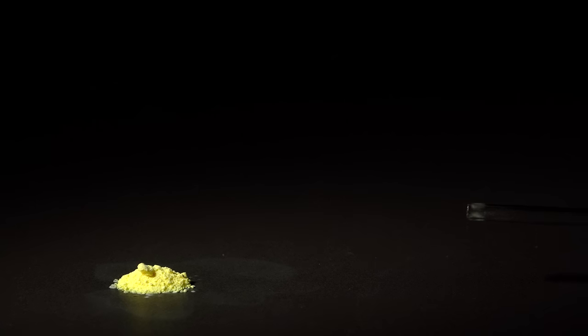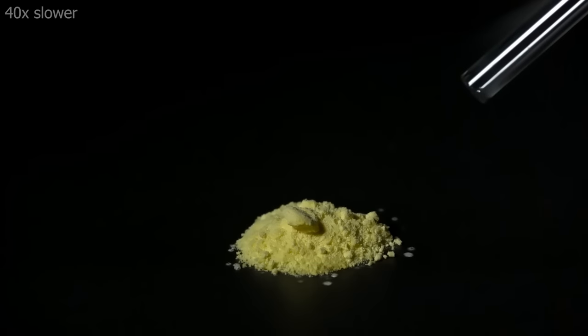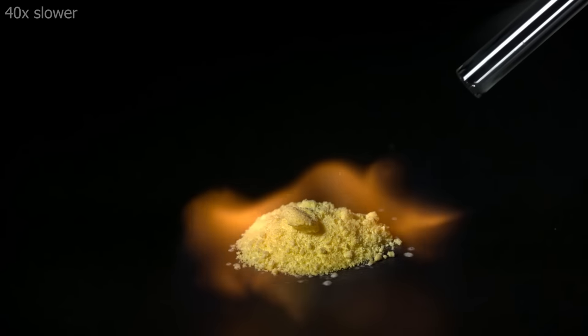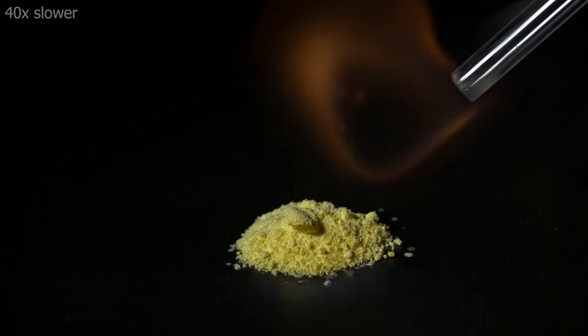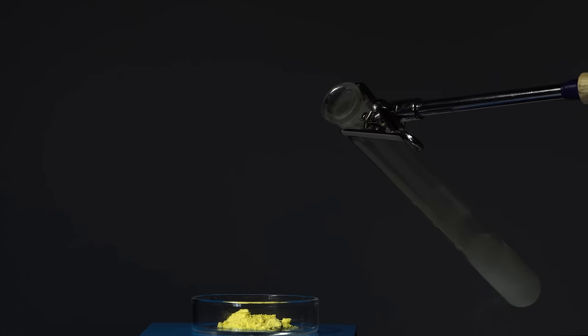Since potassium superoxide ignites hydrogen sulfide vapors with ease, and causes a very violent reaction with liquid hydrogen sulfide.